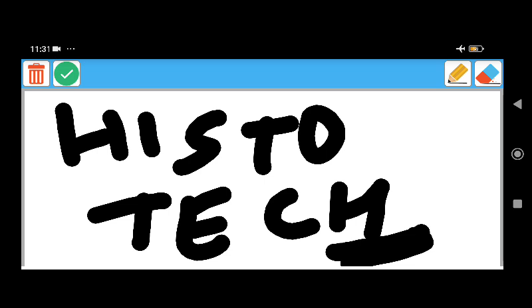Next is microtomy. Once the tissue has been embedded, it must be cut into sections. Microtomy is the means by which the tissue can be sectioned and attached to a surface so that examination by microscopy can take place. Microtomes are precision instruments designed for cutting thin sections of tissue, thin enough to enable examination under a microscope. For routine histological examination, tissue sections are cut at a thickness of 3 to 4 micrometers. Once cut, the sections are floated on a warm water bath that helps to remove folds.